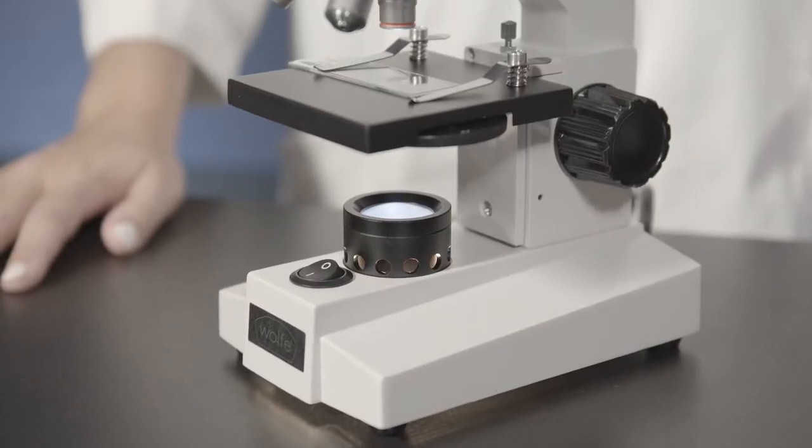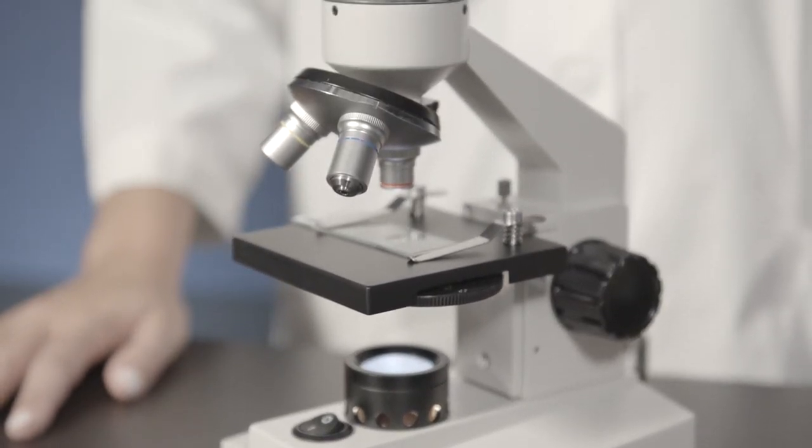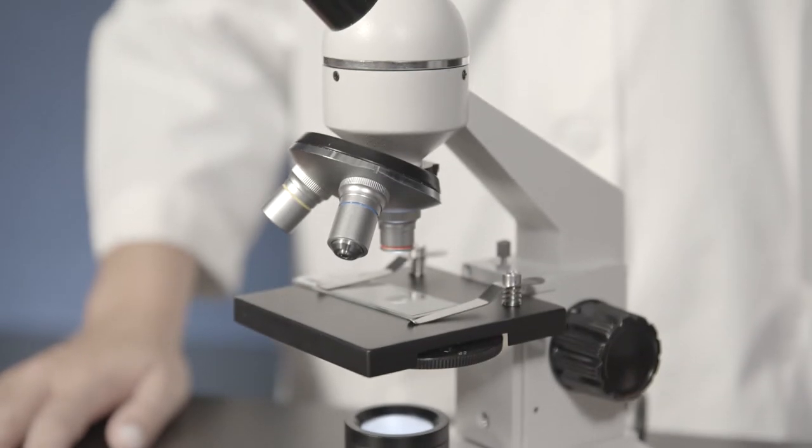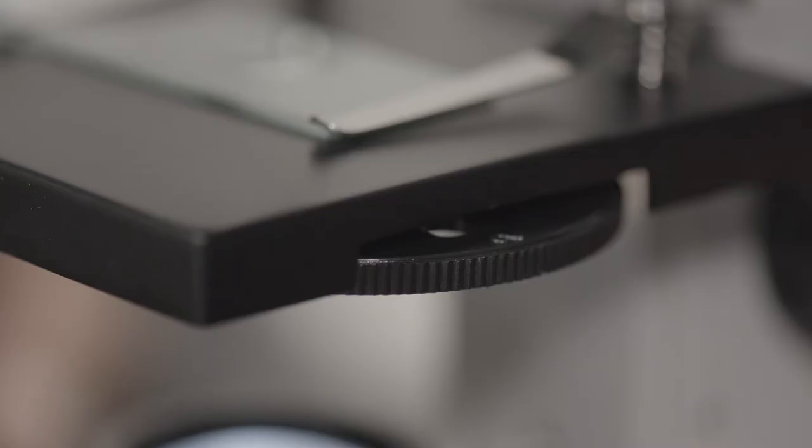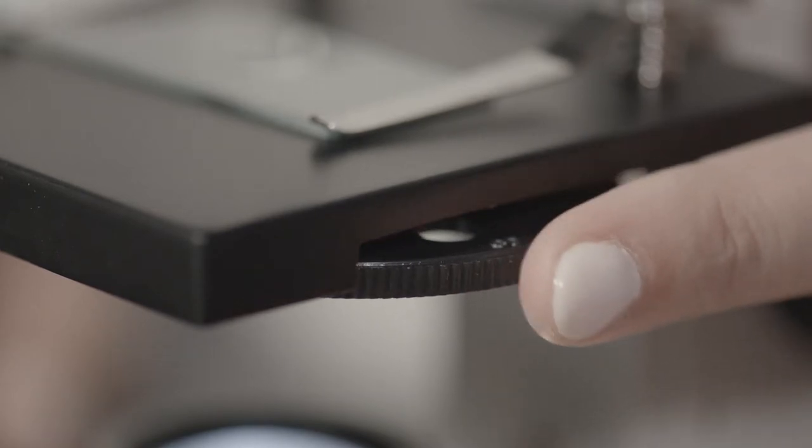Microscopes for introductory-level students usually control the amount of light entering the objective by using a 5-hole-disc diaphragm. Rotate the diaphragm while viewing the specimen to achieve the proper light level and image contrast.